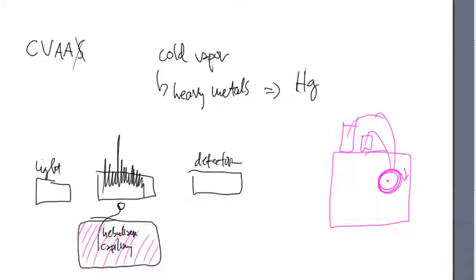So these two solutions are pumped through, and they get pumped around the pump, and they get sucked up with my sample. There's going to be probably a small platform that sits out here in front, and this small platform is what will hold my beaker with my sample in it that contains the mercury. I'll draw that sample blue. And there's a sample tube that comes from it as well. So these three kind of converge and they go into a mixing chamber. And finally, the mixing chamber is hooked up to the traditional nebulizer tube, and that gets pumped in to where the burner head would be.